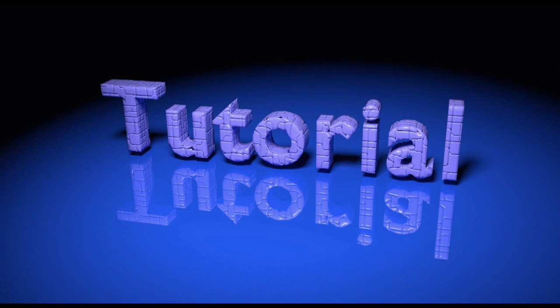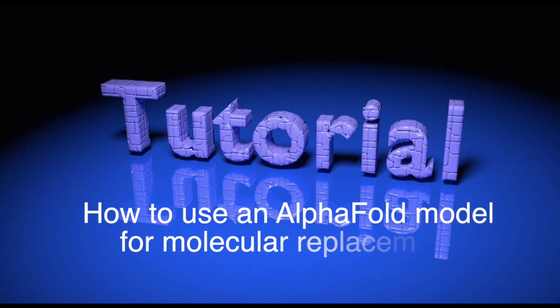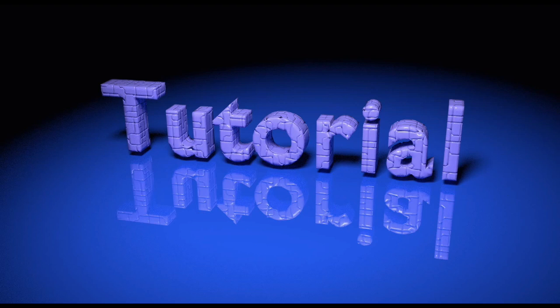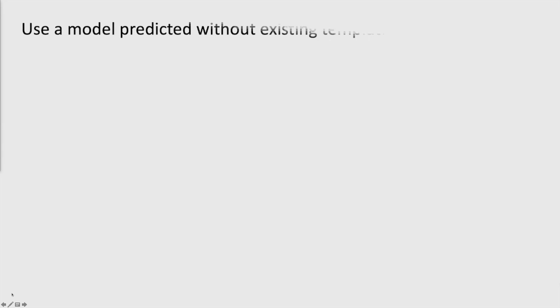Hi everyone! This tutorial shows how to use an AlphaFold model for molecular replacement. In particular, it illustrates the case when a model has been predicted without templates or homolog structures.